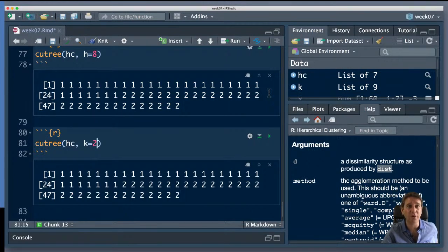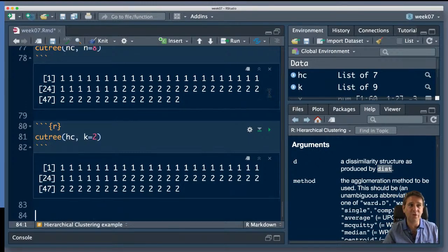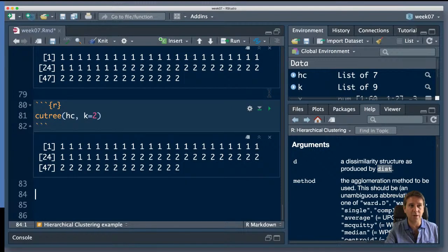And I'm going to go and plot that up. Actually, I've been talking for a long time. I apologize. Let me see if there's any questions after I make this little plot, and we'll talk about this a little bit more based on those questions, and then we'll take a break and we'll go into principal component analysis, actually the more interesting part of this. So let me first plot this up, and we'll then look at question responses if there are any.